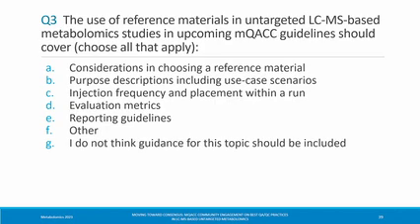Kind of a different viewpoint in terms of looking at the value of the QCs. It's what problems or sources of errors we're trying to correct, right? A pooled sample does something very different than a reference material, which does something different than, say, a solvent blank versus a regular blank. So in reality, if we're going to correct for all those sources of error, we need all those sources of QCs, at least in my opinion.